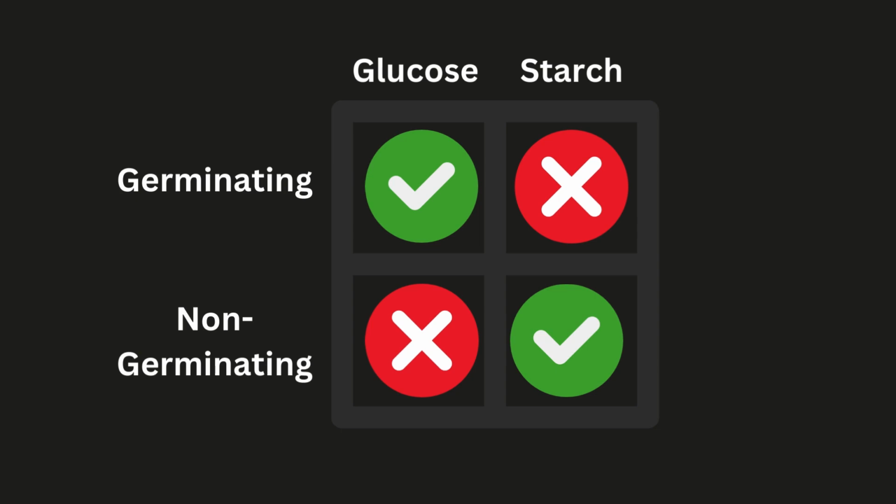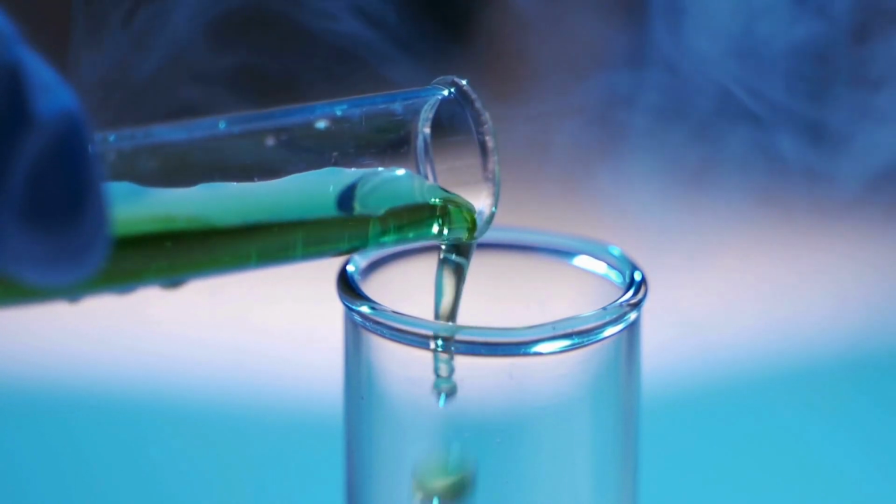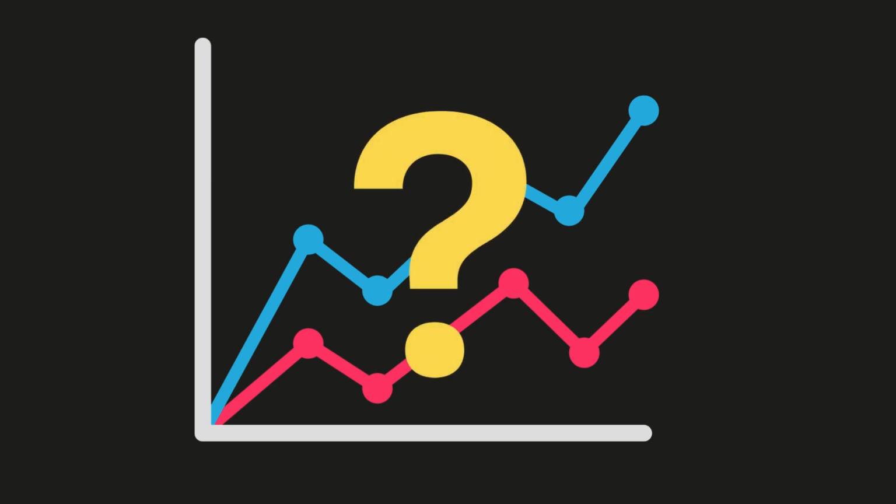The non-germinating seeds passed the iodine test, but failed the Benedict's. This means that it only contains starches and not simple glucose sugars. After germinating a sample of seeds, we tested it with iodine and Benedict's tests. Due to the improper testing conditions, both tests were unsuccessful and inconclusive.